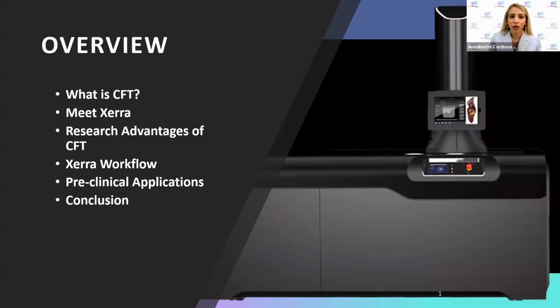So today I will be going over CFT, or Cryo-Fluorescence Tomography. I will also be highlighting our technology, Xerra, our imaging platform, and the research advantages of using CFT. I will also highlight the workflow, in addition to the preclinical applications that have spanned CFT technology.